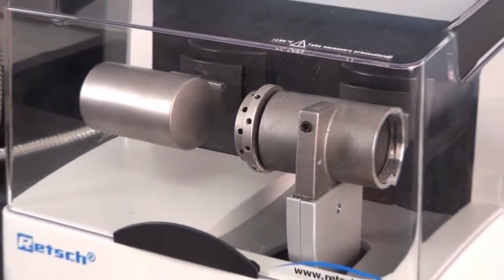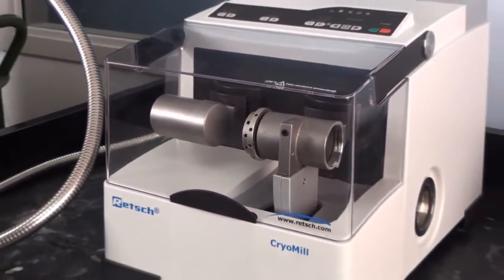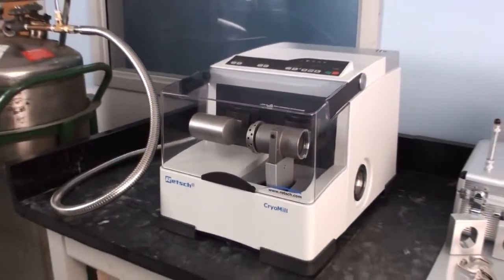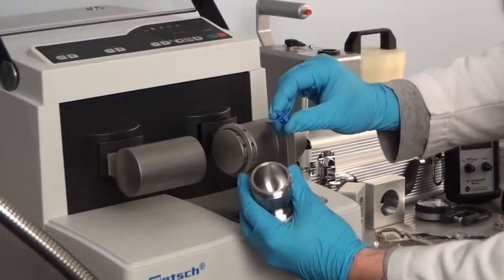The brand new state of the art cryogenic mill for the preferred CPSC methodologies of plastic substrates.